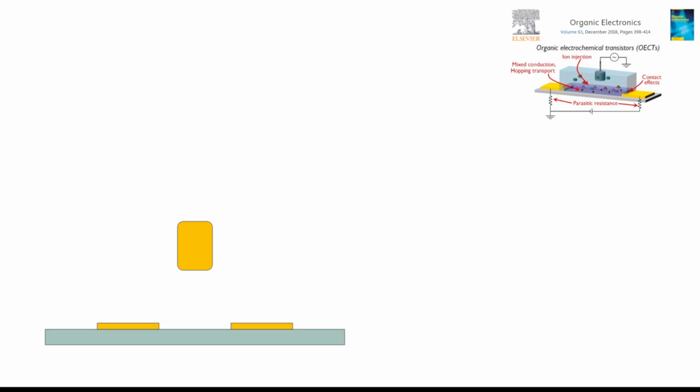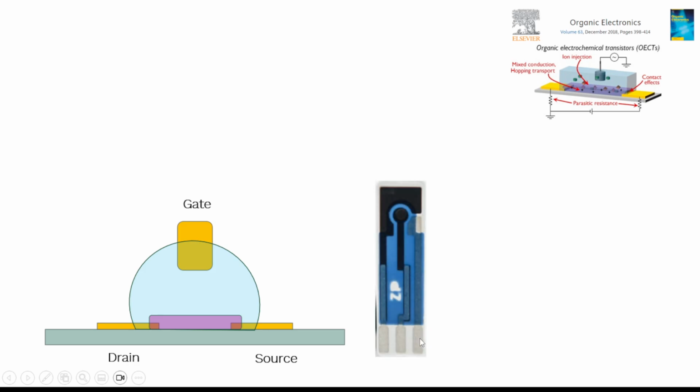If I think about these organic electrochemical transistors a little bit, they involve an organic semiconductive type material between the electrodes, between the drain and source, and then you have a gate sitting in the solution. So I'm going to describe how I would do this on a screen printed electrode. So here's my screen printed electrodes, my carbon 501. It's actually quite a good choice for this, because the cost of materials is really good, and carbon is quite inert. I think it's actually better than using something like gold, to be honest with you.